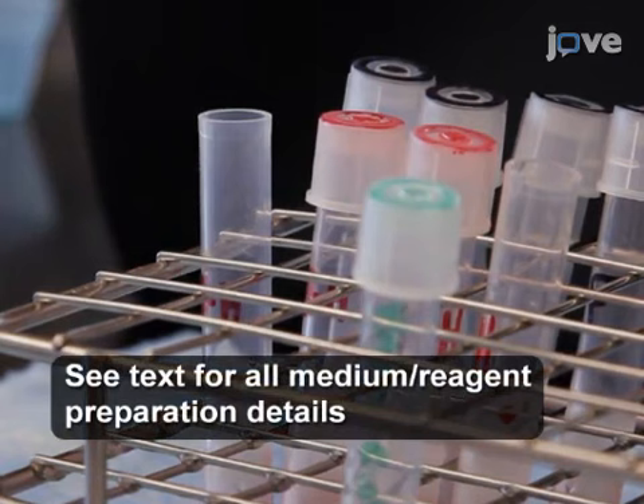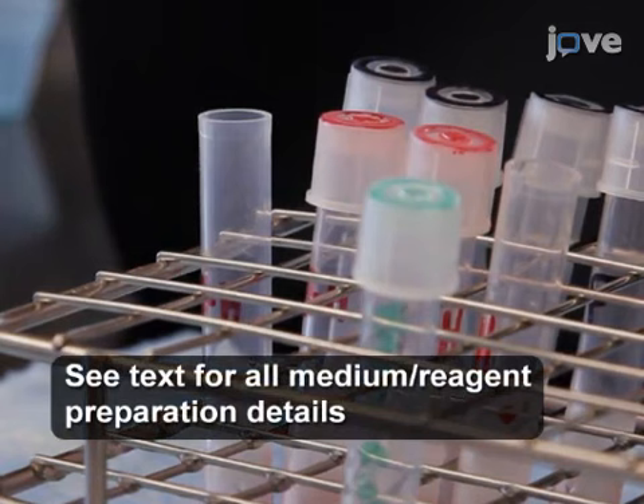When all of the blood has been transferred, add 10 microliters of the HE working solution to the tubes labeled with red ink and an H, including the HE control tube, and cap the tubes. Vortex the samples briefly.